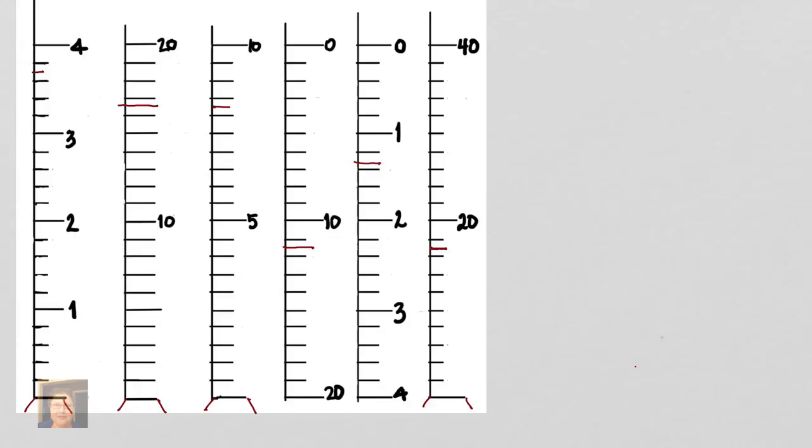And so this technique is called the 10% rule. In general, what this means is we're going to record some number, and then we're going to record the number of marks past that number to the first decimal point. Now, at first, that's going to give you a number that's nonsensical until you realize that each one of the marks has a different value depending on what kind of device we're working with. So before we add our marks in, we're going to multiply them by the value of the mark.